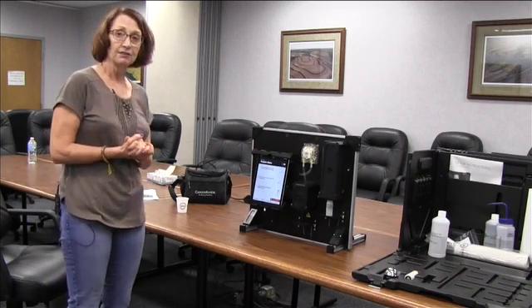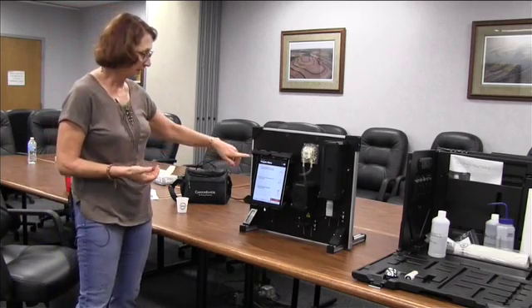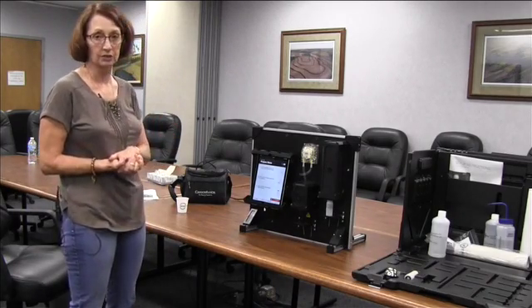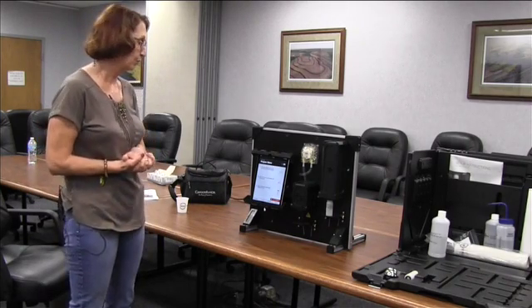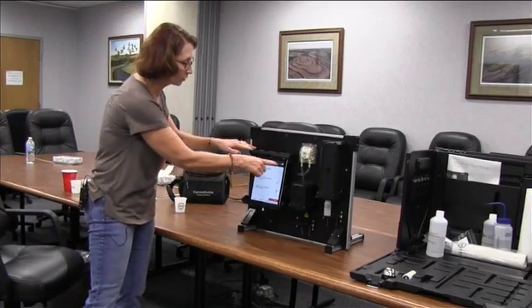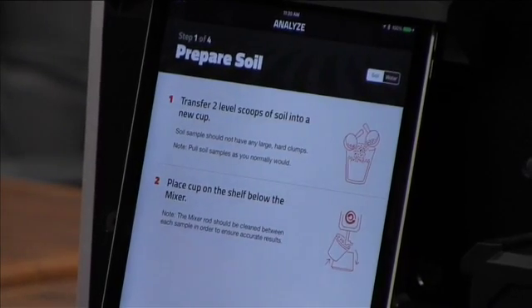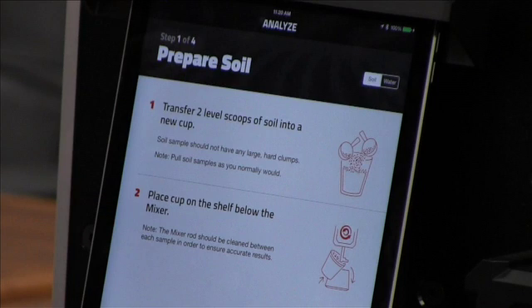After the unit has calibrated itself, it will walk you to the next step and ask whether you want to do a soil test or a tile water test. We are going to look at doing a soil test first. In the upper right-hand corner, press either water or soil — we're going to go with soil. That changes the instructions a little bit, and it will now ask you to prepare the soil sample.